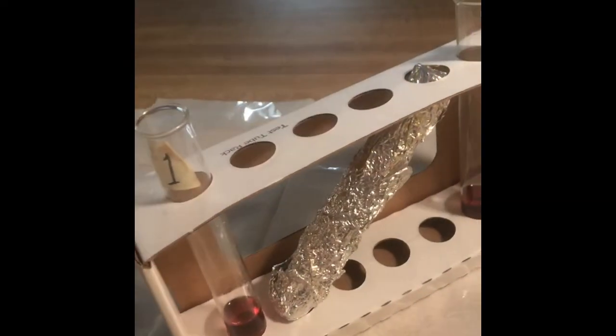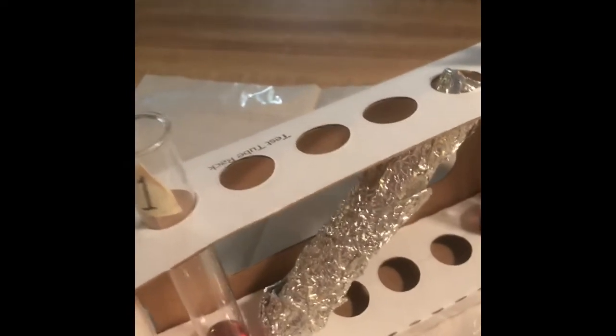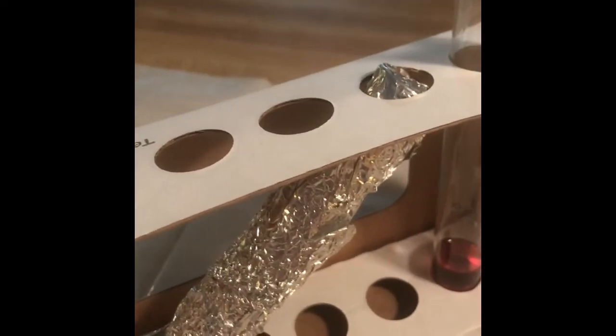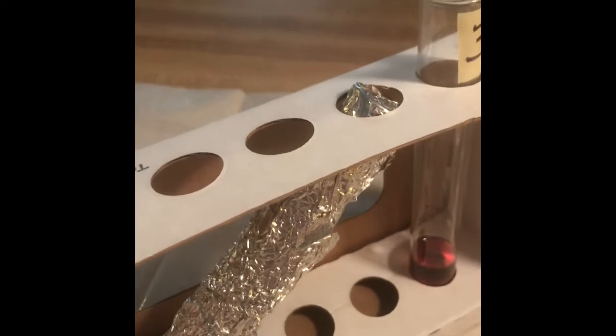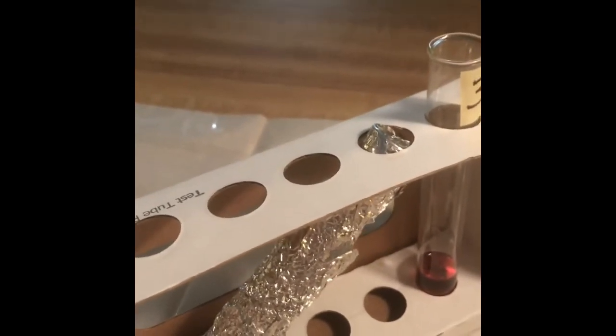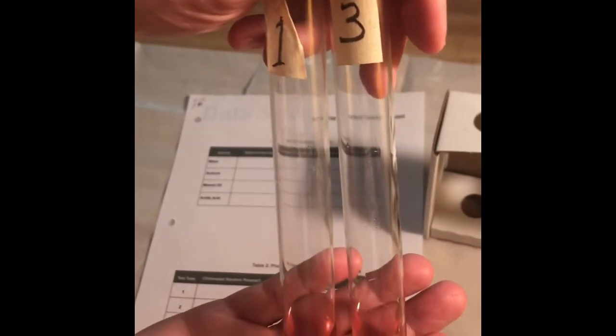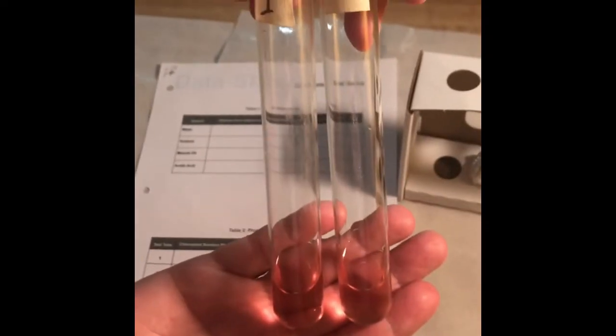It has now been 1 hour since we put these test tubes under the light. As you can see here, this one looks a little bit lighter purple, as does this one here. I'll just continue to update you all until we get this whole thing done. Another 2 hours have passed for a total of 3 hours. And this is what the color looks like now for test tubes 1 and 3.